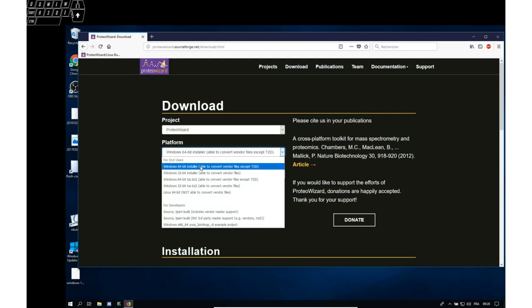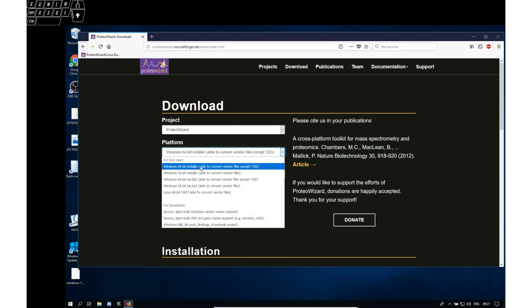One note is that the MS Expert Suite now runs only on 64-bit machines, so if you have a 32-bit machine it must be fairly old and maybe it should be replaced or you may find another machine to run the MS Expert Suite software.